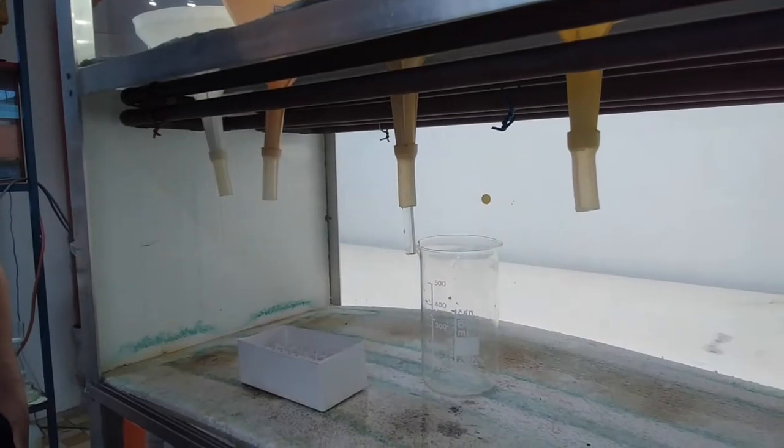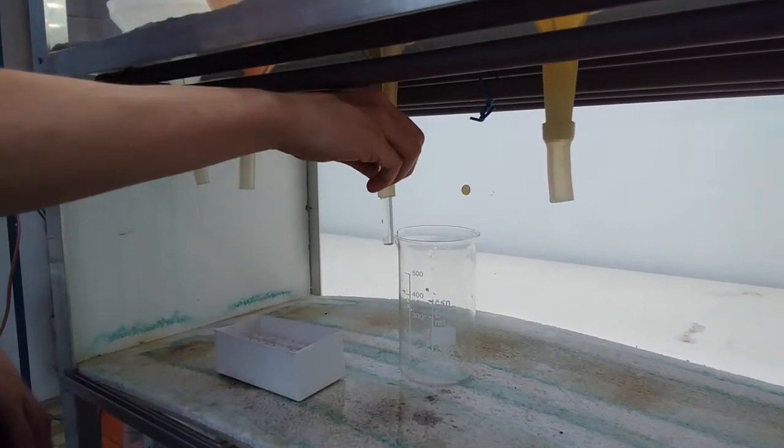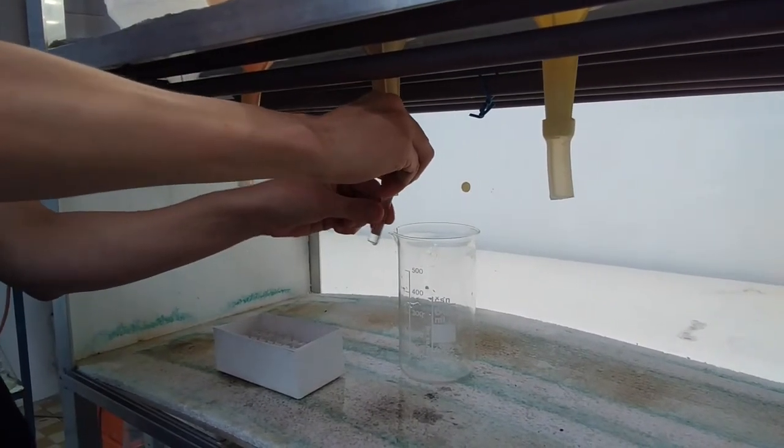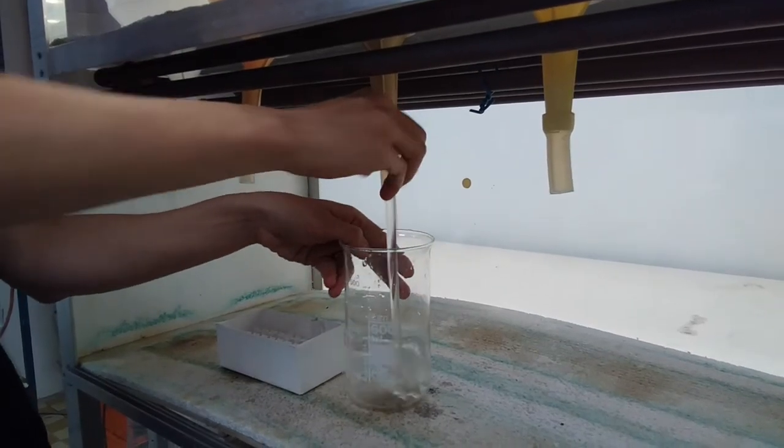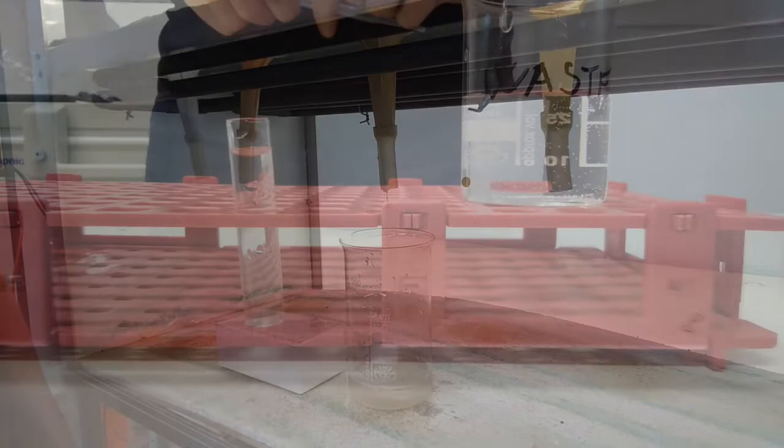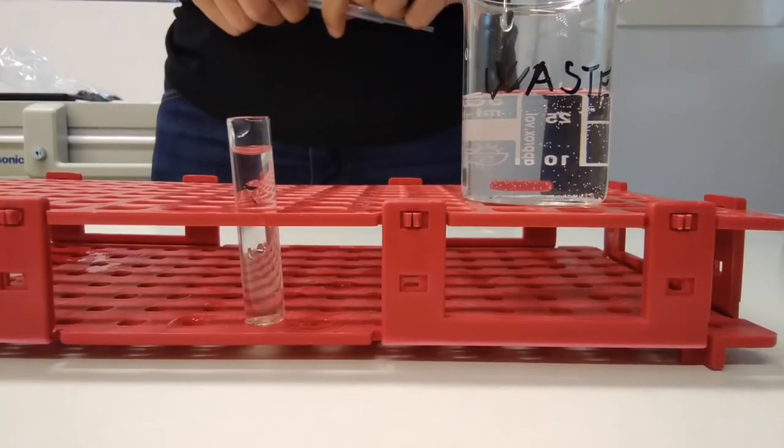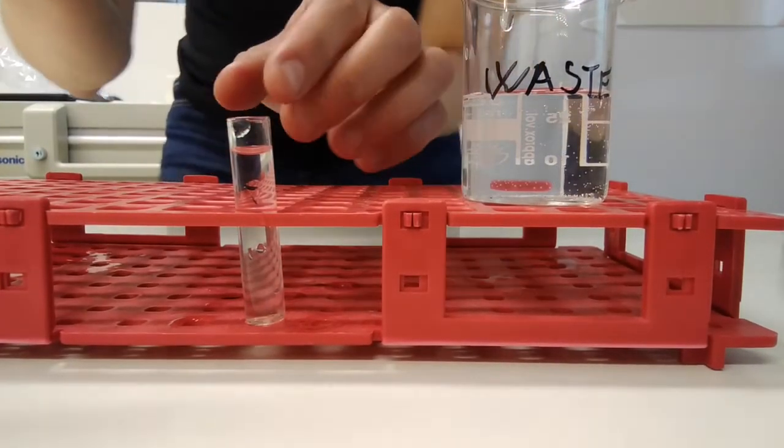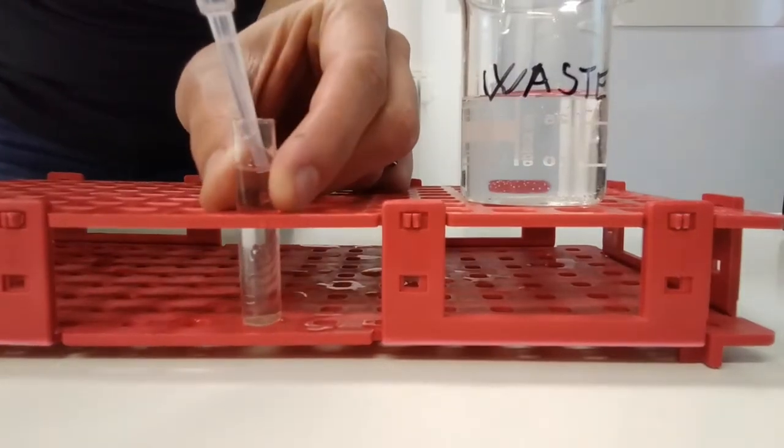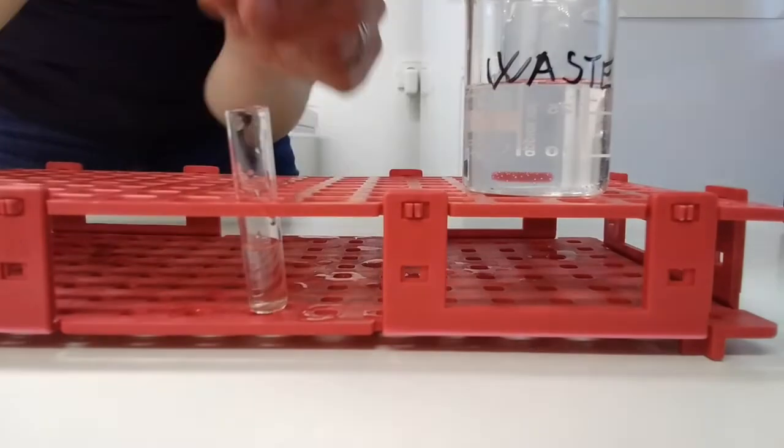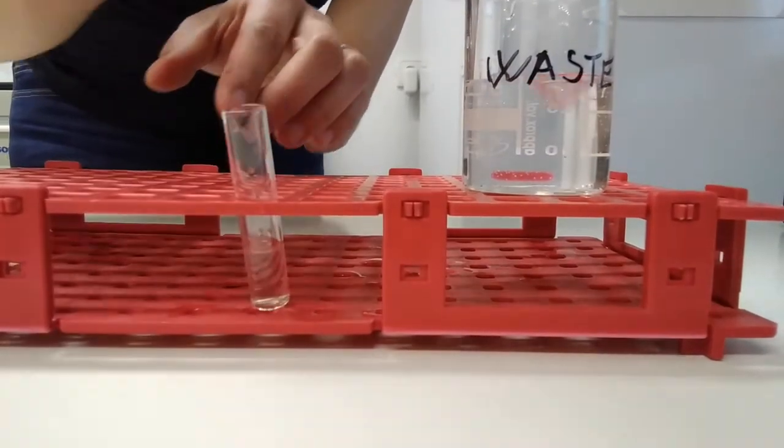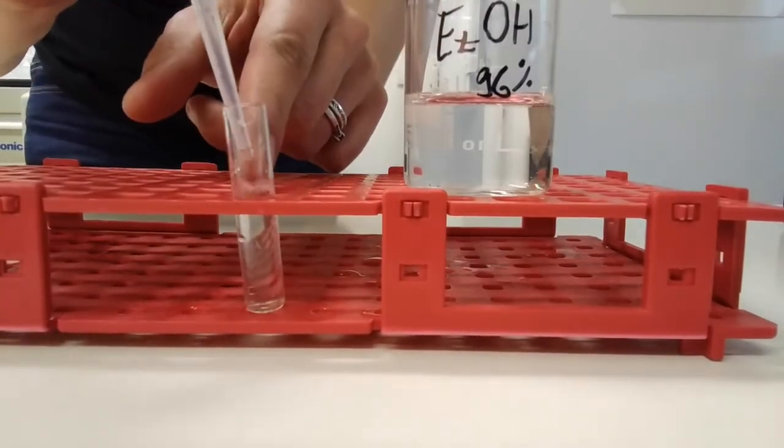To remove the extracted animals, strangulate the hose with your fingers. Gently remove the vial and discard the rest of the water in a waste jar. Now we fix animals in ethanol. All animals are at the bottom of the vial, so we carefully remove three quarters of water from the top of the vial and fill the vial with 96% ethanol.